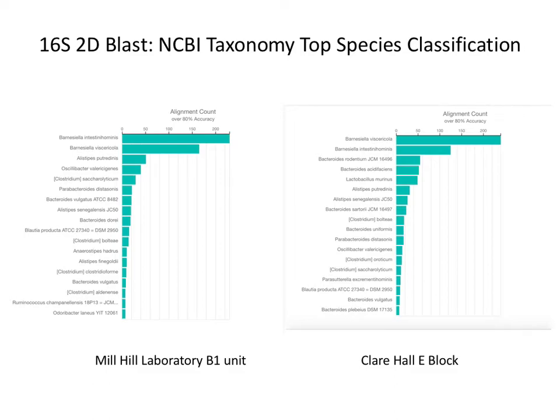So it's cost. With the short read, you can't really call down to species level. You can just about maybe even genus level. A bit dodgy. Yeah.